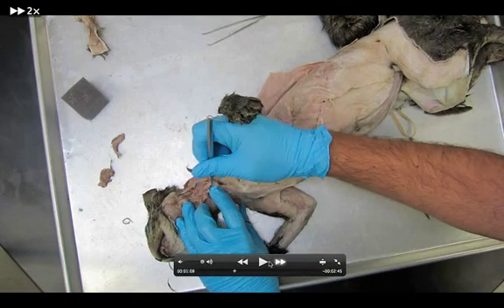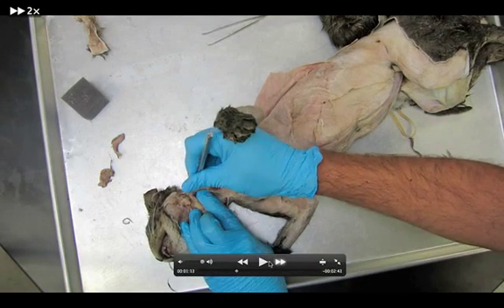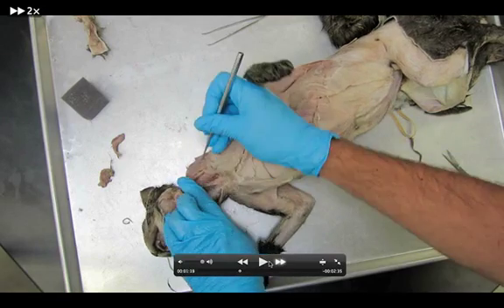Right now we're just freeing things up, making sure we can see each individual muscle.